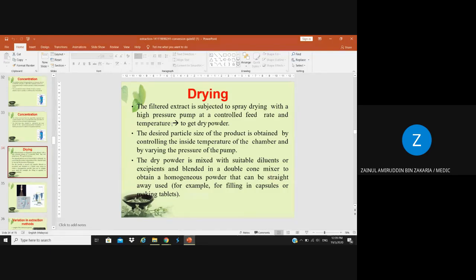What you need to do, you dissolve it back in water. Okay. Depending on the dose that you want to prepare, whether 50, 250, and 500 mg per kg, you need to measure the dried powder and then you put water so that you prepare to the exact dose.